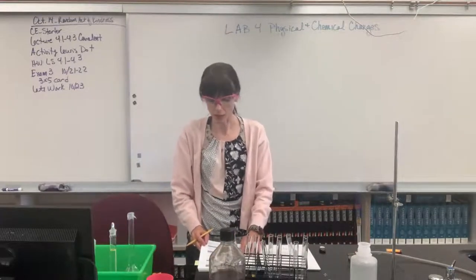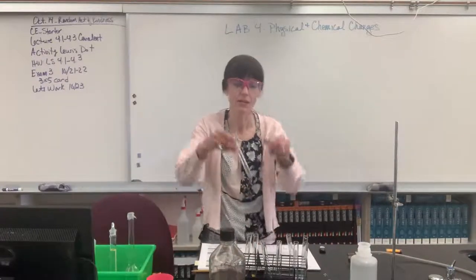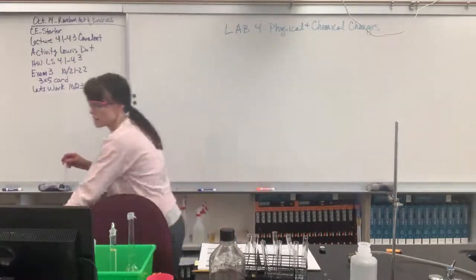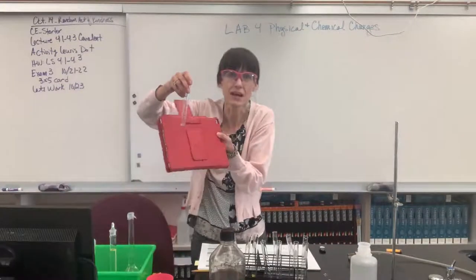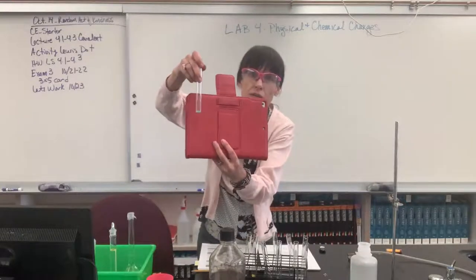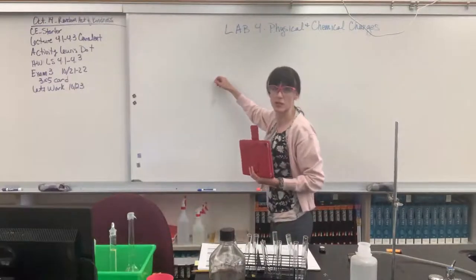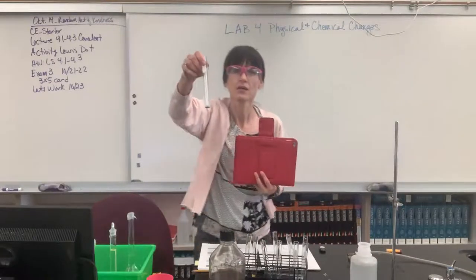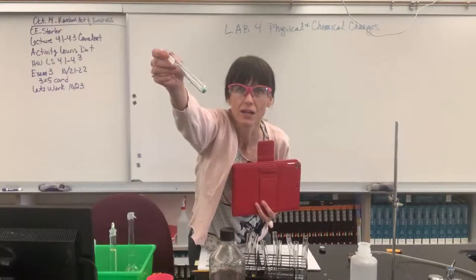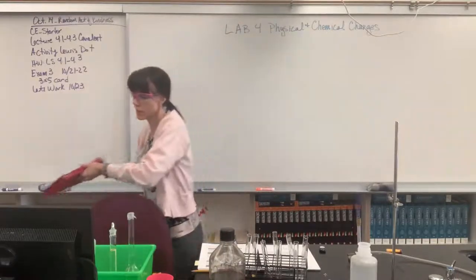It says heating copper carbonate. Weigh out 2 samples of solid copper carbonate. Here it is. Oh, you guys, it's a beautiful green color. Let me hold this up. I'm hoping that you can see that. You can see this green color. You can zoom in on your screen. It's a really, really pretty green. Maybe if I put it against the board, you can see with the white. There's a really pretty green. Oh, there you go. You can see it. It's a really pretty green color. It's like a seafoam green. Okay, cool. Okay, so that's copper carbonate.